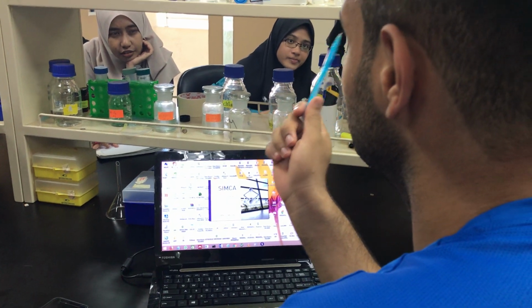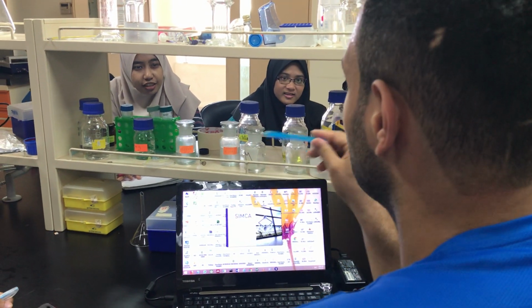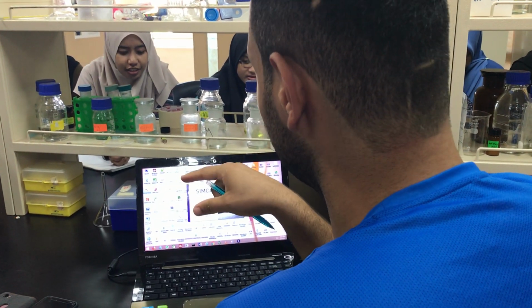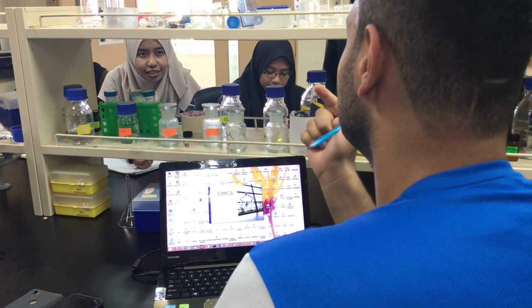Like that, there is no significance in the result. I mean, in repetition, you can see almost all above 90%. In the beginning, I'm not able to run SIMCA because when I put the data in and ask the software to run to see the difference, it gives me 0. There is no difference. Then there is another option.